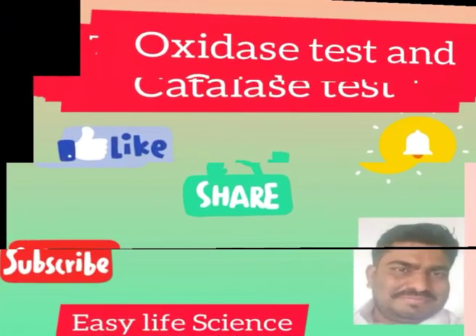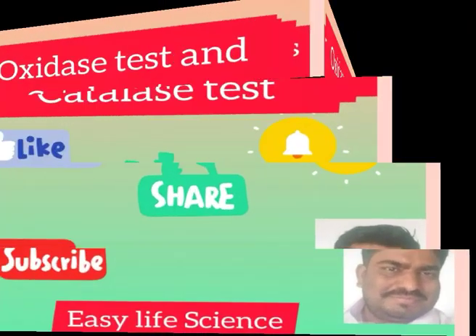Here I am talking about oxidase test and catalase test.